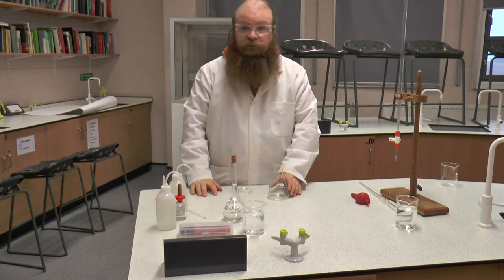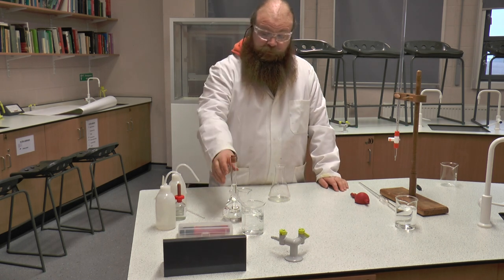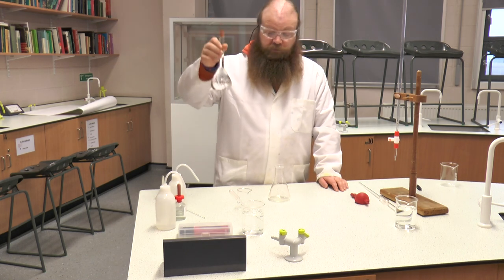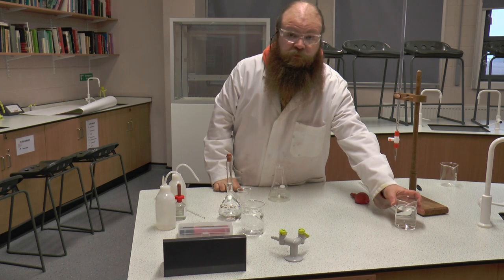The next stage of our practical is we're going to do an acid-alkali titration. We're going to be using our standard solution of sodium hydroxide, which we're then going to be titrating against hydrochloric acid.